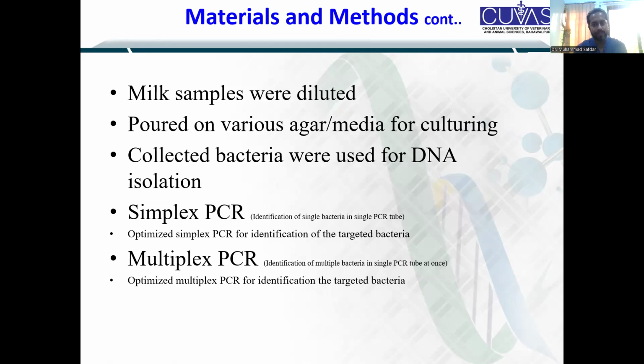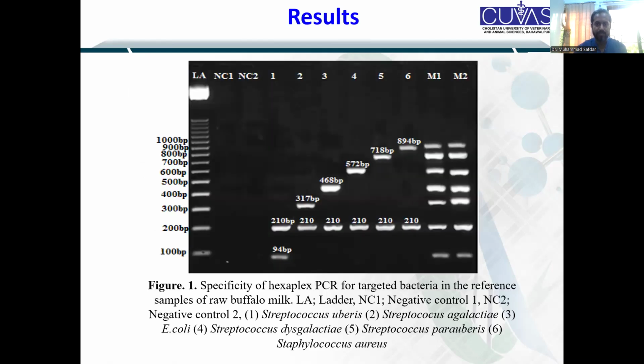After that, milk samples were diluted and poured on various agar media for culturing. And then we collected the cultures for DNA extraction. And finally, we optimized simplex and multiplex PCR.